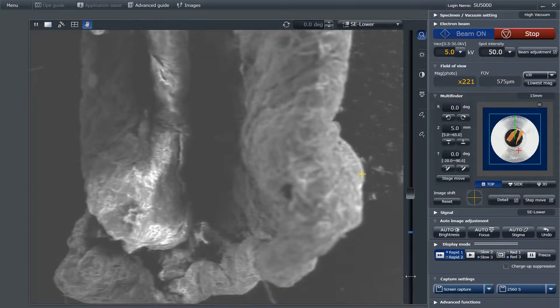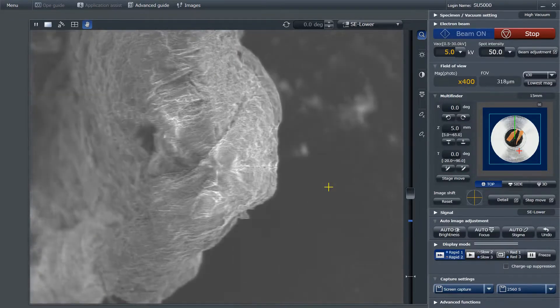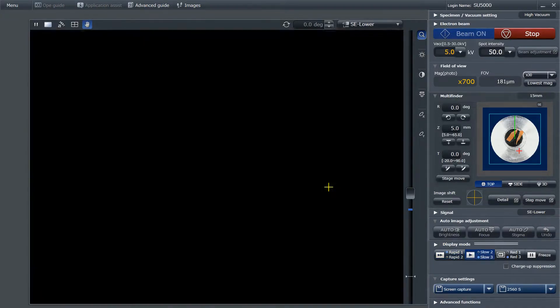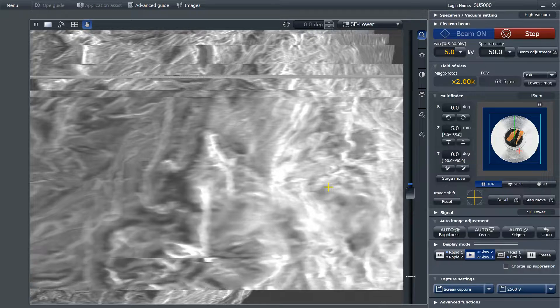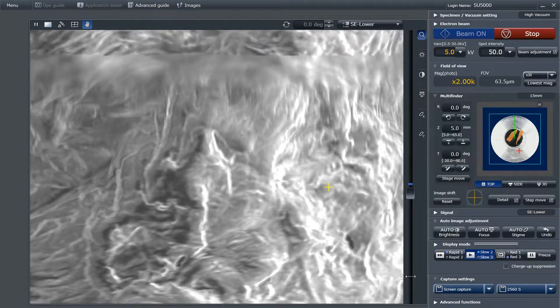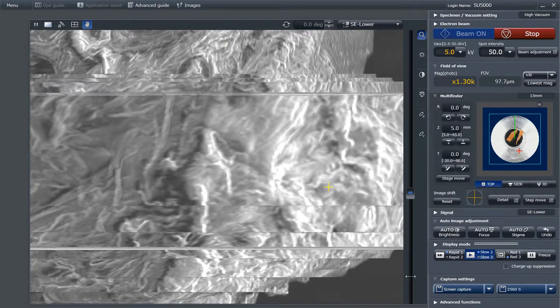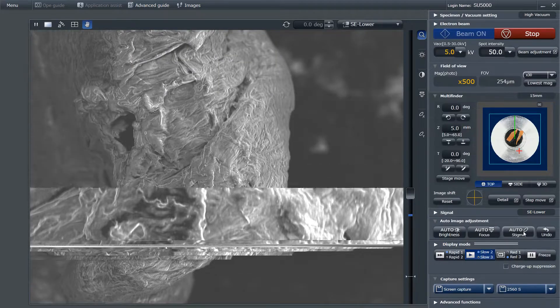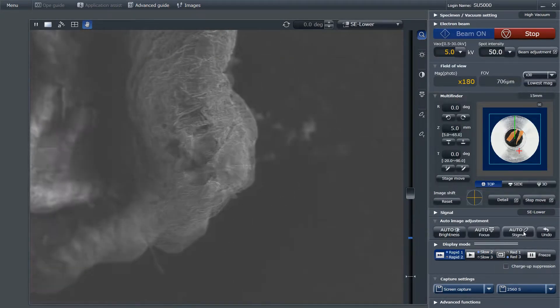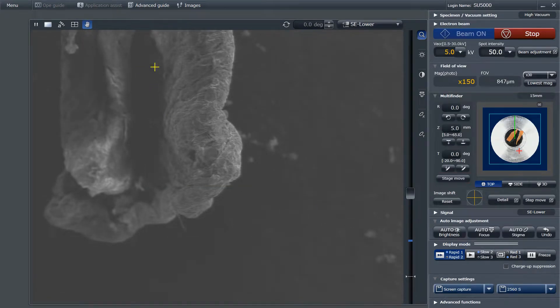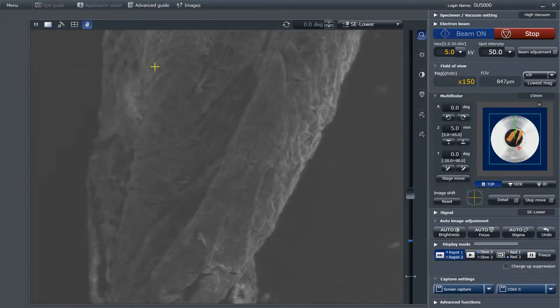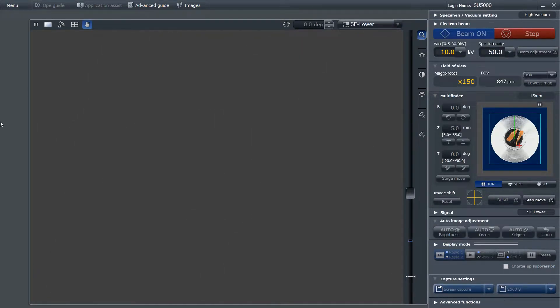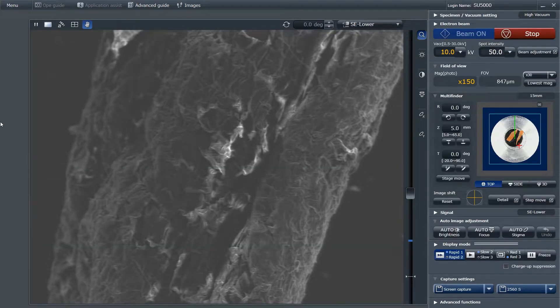Now because I have adjusted the vacuum to contain less air, I am able to do a live video feed of the sample. I can switch between live video and scanning at will. Now I'll just change the accelerating voltage so that I get a better image while using live video.